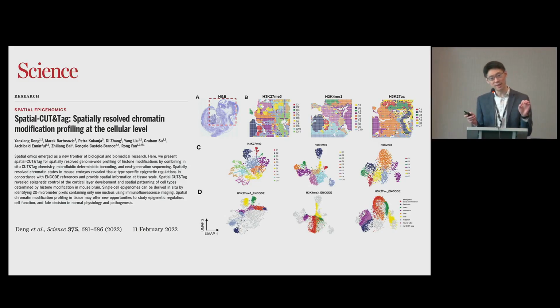Okay, that's the key message. You are not trying to just identify cell types or tissue types. People constantly ask me this question: which sort of data can better identify cell type? This may not be a valid question. In this case, the goal is not to identify cell types, but to reveal the mechanism, whether or not that histone modification does play a role in the development of that particular tissue type in this whole organism.